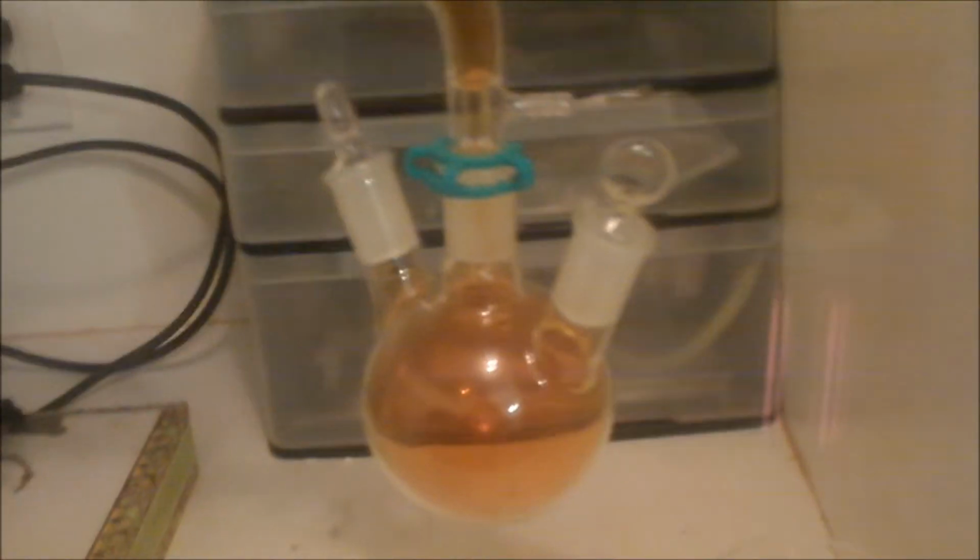Okay guys, we have a thick brown gas forming inside the reaction vessel, and going up the column it gets somewhat thinner, and there's the funnel with the sulfuric acid in it, and you can see possibly a distillate forming at the beginning of the condenser. It's going to be a little bit foggy because I have my fume hood down, so then coming down the condenser into the receiving flask. We have yet to receive any distillate, so very shortly we will start receiving it, and I will record it.